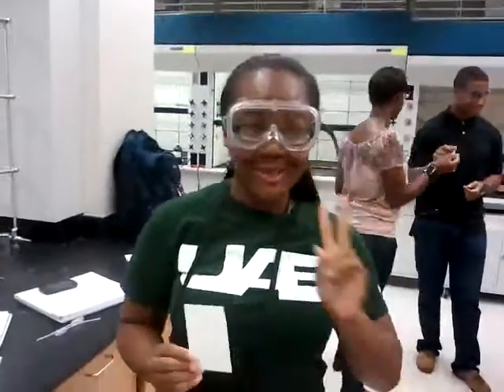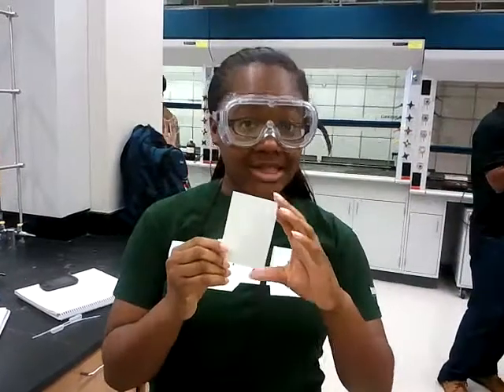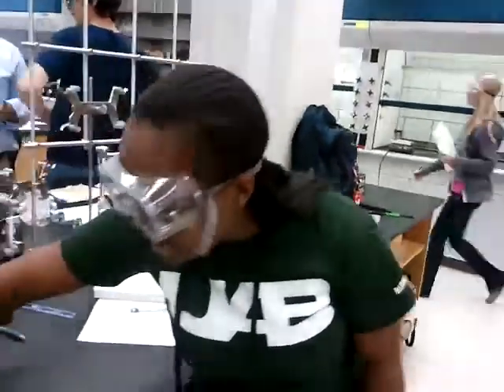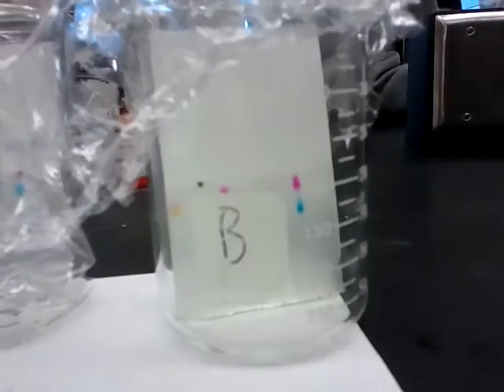So now I'm going to talk to you about the two different kinds of phases. The first phase is called the stationary phase, and this is actually just going to be the TLC plate, and the substance is going to remain stationary on here. The next phase is the mobile phase. As you can see here, the solvent is moving in this phase, and the dyes will be separating.